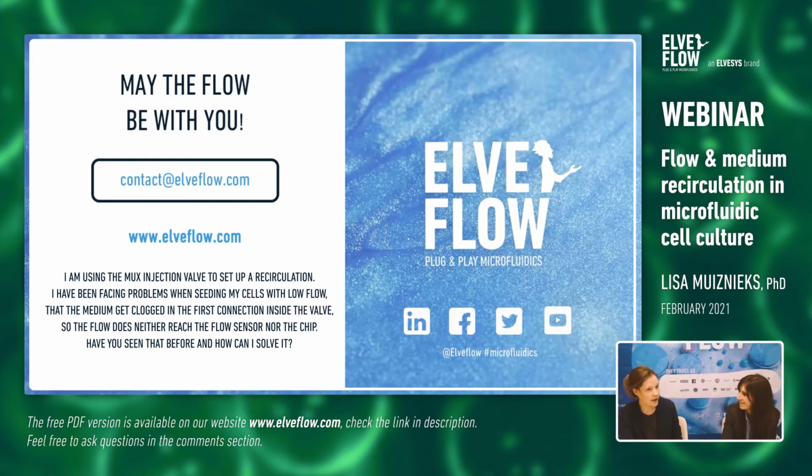Yeah, so I'm not clear if you're seeding your chip first, I imagine, and then you seed with the concentration of cells that you want, let it attach in static conditions, if you like, and change the media by hand until the cells reach a confluence that you desire. Then hook it up to your MUX-recirculation. And actually, if you have a lot of dead cells that haven't attached, you can consider flowing a chip full of medium over your cells before you attach to the MUX-recirculation, or consider even adding a valve to be a waste collection.